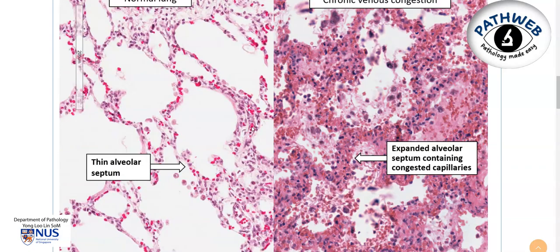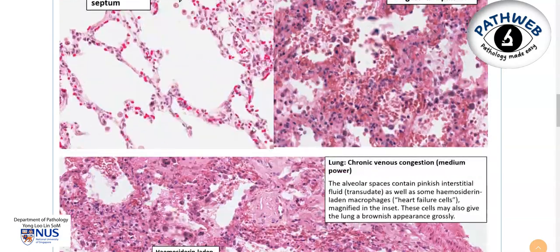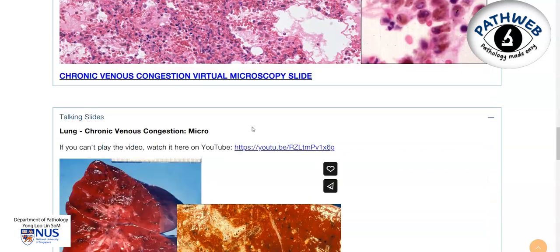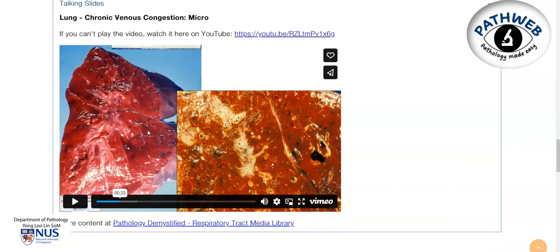There is a separate video highlighting the salient microscopic features. As you scroll down, you will see our videos and here is a more fresh example of chronic venous congestion. We can see the lung is very reddish in colour and on the cut surface it has this brownish appearance.